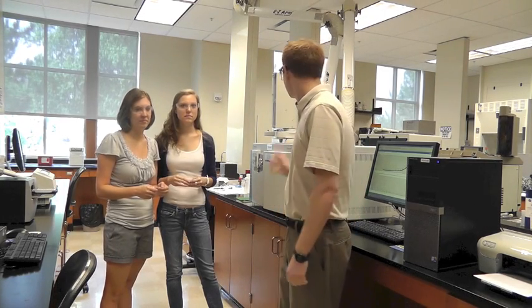Hi there. I'm Dr. Booth and I'm here with Morgan and Rebecca and we're using an instrument called GCMS — the exact same model seen on CSI Miami no less. And we're performing a forensic experiment to analyze the chemical composition of fingerprints.